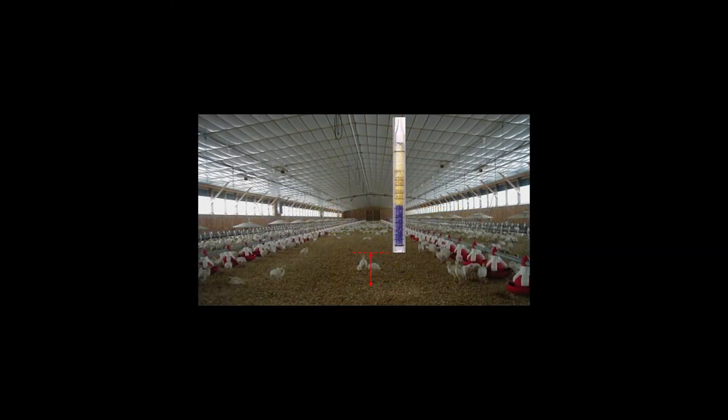The tube can be positioned near but out of reach of the animals for animal welfare concerns or at building ventilation exhaust outlets as part of an emission calculation.